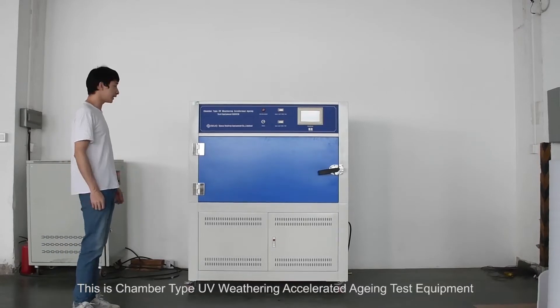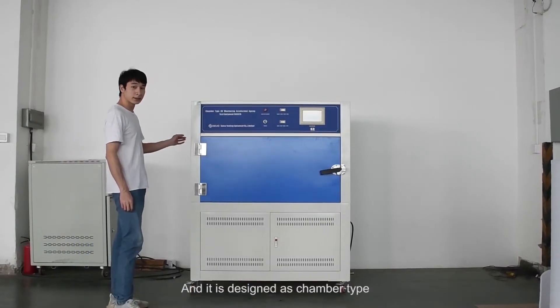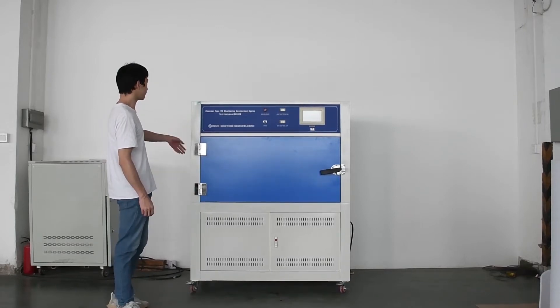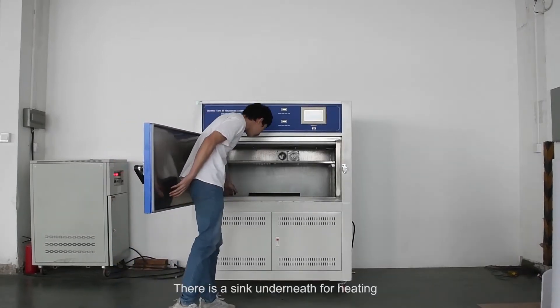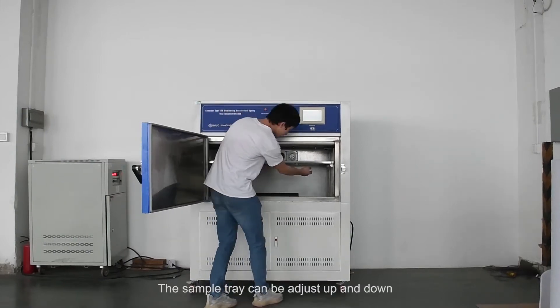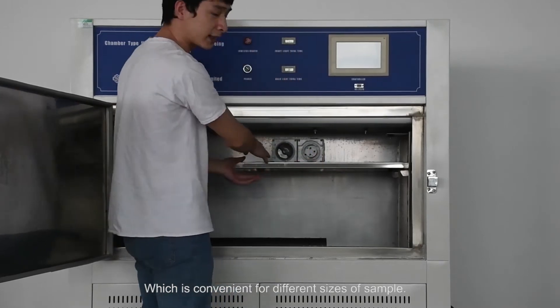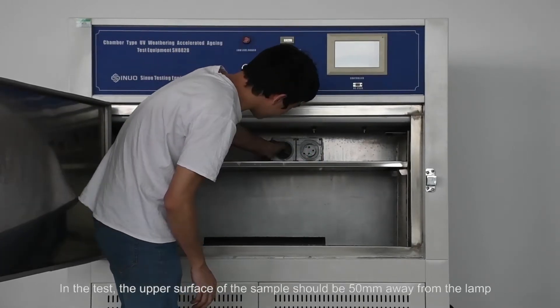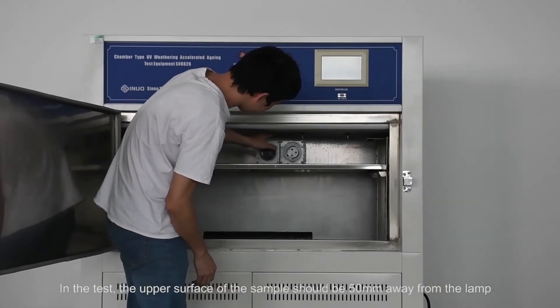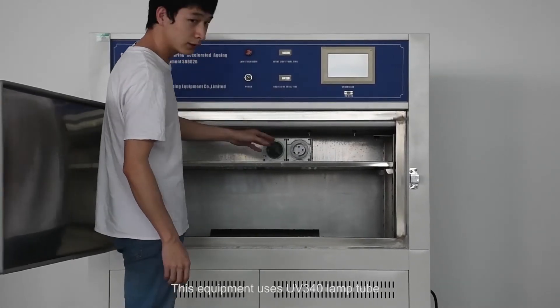This is a chamber type ultraviolet weathering accelerated aging test equipment. It is designed as a chamber type with a sink underneath for heating. The sample tray can be adjusted up and down, which is convenient for different sizes of samples. In the test, the upper surface of the sample should be 50 millimeters away from the lamp.